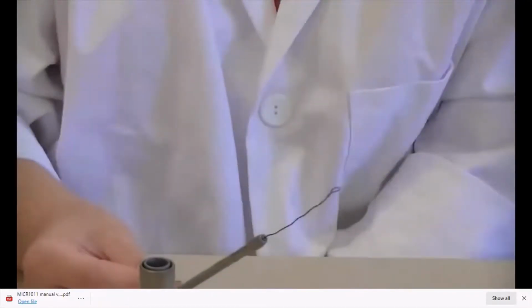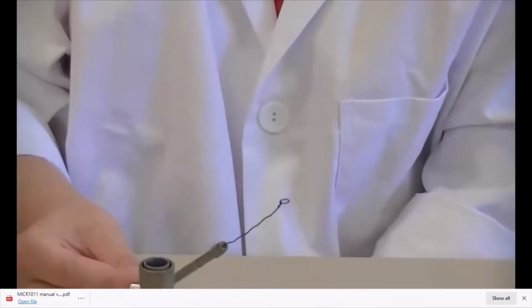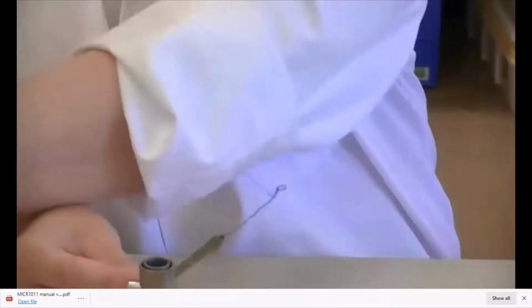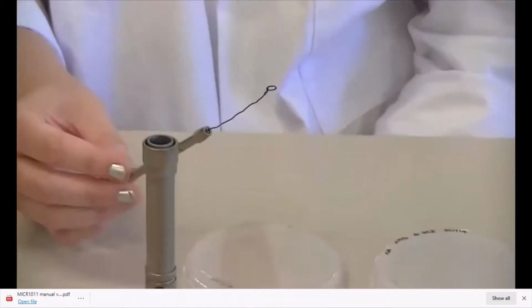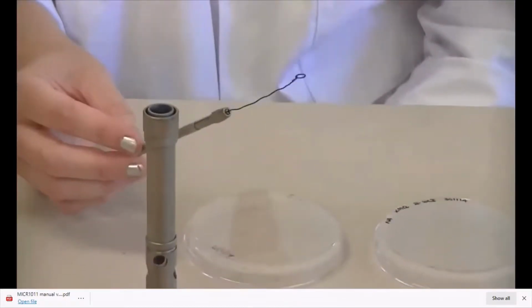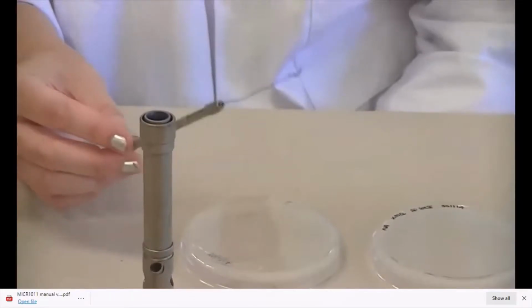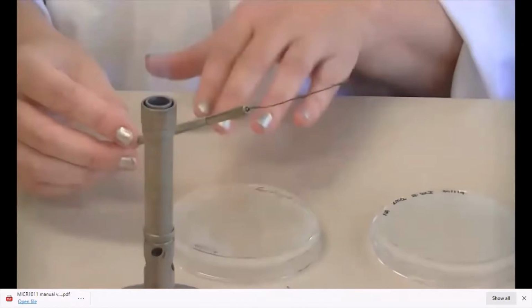Once that's sterilised, you need to let it cool for a few seconds, so just hold it near your Bunsen flame. A way of determining whether the loop is cool enough is to actually touch it to the agar surface of the plate. The loop needs to be cool, because if it's very hot, it can actually kill the bacteria or yeast that you put onto your loop, and you don't want them to be killed.